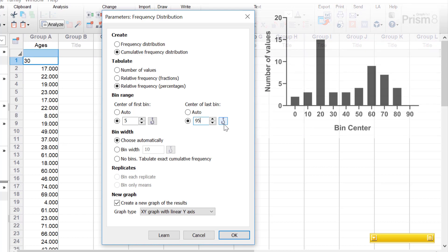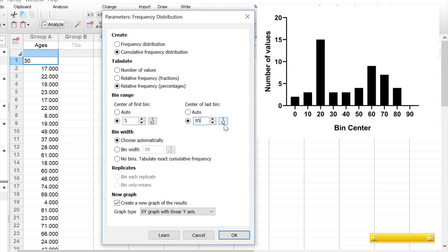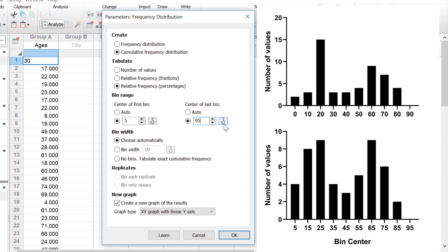So how important is the bin range? In this example, the center of the first bin is 0 and the center of the last is 90. Since the first bin center is 0, it would contain values between minus 5 and positive 5 — but in our dataset we only have positive numbers, so the first bin can only contain values between 0 and positive 5. In the next graph, the center of the first bin is 5 and the last is 95, which is more ideal since the first bin contains values between 0 and 10, and the range is equal throughout. Notice how the two graphs differ just by adjusting these centers.